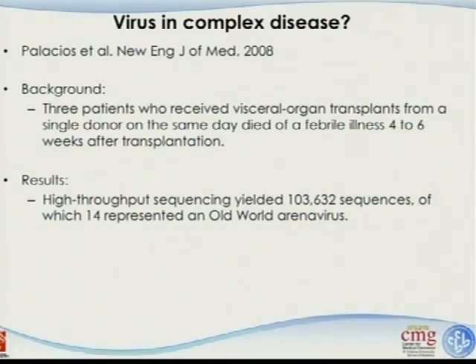I think this was published in early 2008, so probably the experiment was done in 2006 or 2007, at a time when Illumina was not there yet. For those of you who don't know, the first commercial sequencer was Roche 454, released in 2006. Illumina 2007, SOLiD 2008. That's why you see the huge imbalance in market share between platforms: some platforms got into the market one year earlier and got a lot more Nature and Science papers than other platforms, so people just followed that. That's one of the reasons SOLiD had a late start.